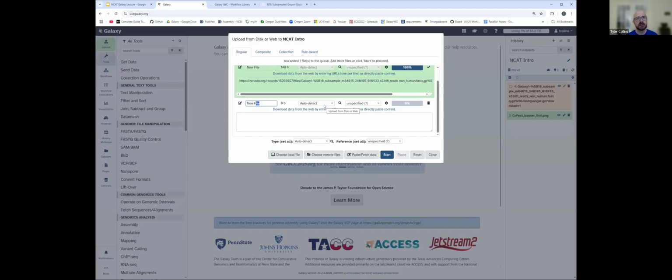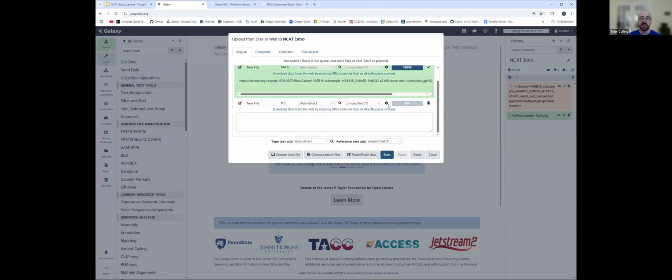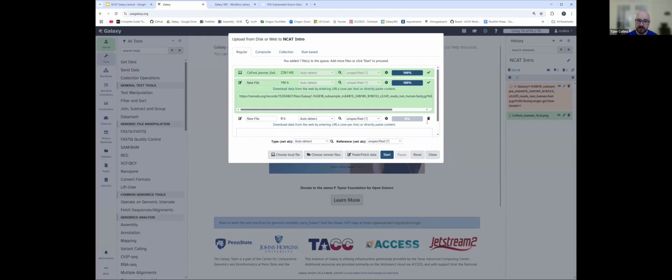You can upload any of those. Galaxy supports, I believe, the vast majority of data types. You can see through here, there's hundreds in here. We'll support PNGs. These are all random bioinformatic data types, especially a lot of mothur, FASTQs, different gzipped files, and more can always be added, especially if new data types are created. We'll support zips, TXTs, tabular, PNGs. Any of that can be pulled in. HTMLs, any of that. So those are the two easy main ways to usually pull in.